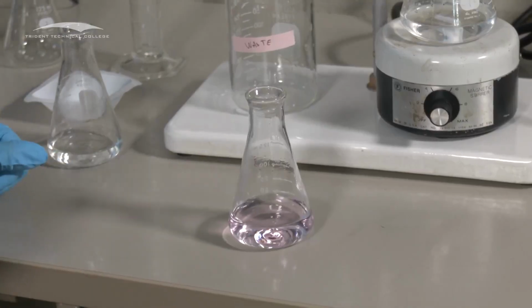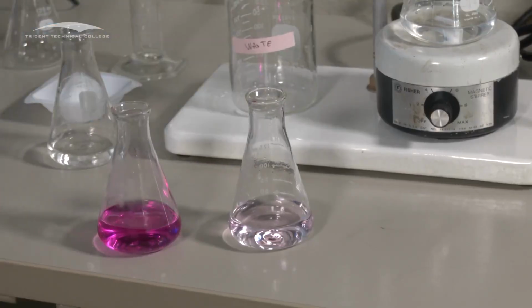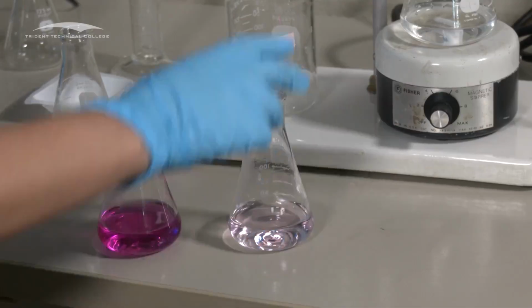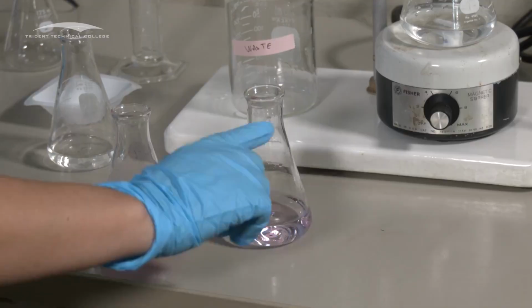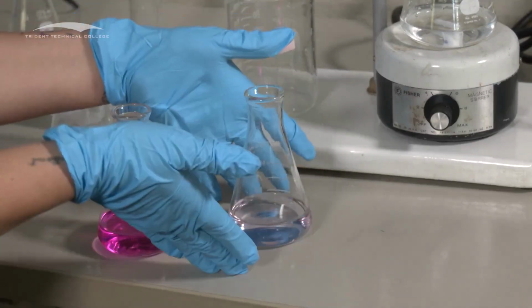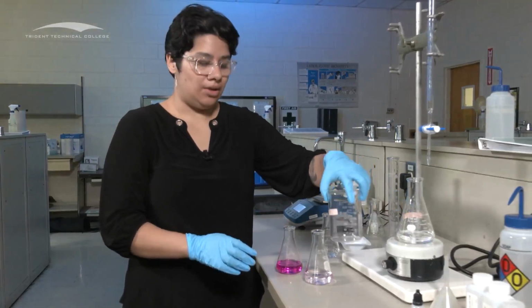A tiny bit darker is okay, but if you went to this color, you went too far, right? So it should look more like this, or somewhere a little bit darker. Sometimes it tends to be a little bit darker and tends to light up, but this is too dark, right? So we don't want that. We want something this color. This means that you finish and then you stop right here. That is your endpoint. Once you are done with everything, everything is going to go in your waste container.